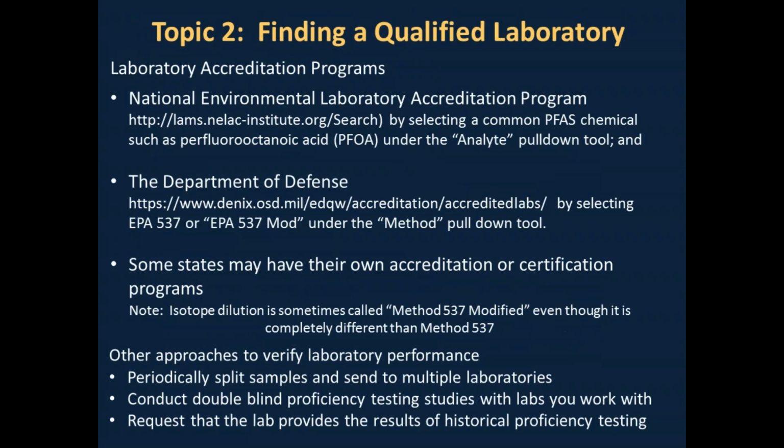Another topic we addressed in the primer is if you are a state drinking water program or water system, how do you go about finding a qualified laboratory? And we provide guidance on how to look up labs that are accredited with either the National Environmental Laboratory Accreditation Program or the Department of Defense. And so we provide links to websites and some guidelines on how to identify the analytes in their analysis query. I'll also note that some states have their own accreditation or certification program, and that would be a good resource as well to see what labs are qualified to analyze for PFAS.